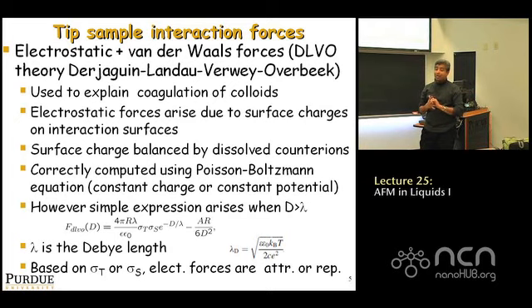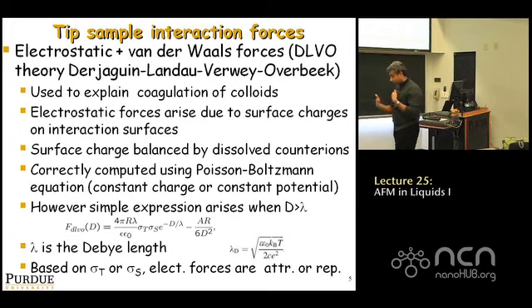When you dissolve salt in water and have ions, the shielding becomes very strong. Now you have free positive and negative ions, so it's not just the dipole moment of the water molecule you're using to shield; you're actually using fully positively or negatively charged ions to shield your charges. So the key thing that happens in water, number one, is that the electrostatic forces get shielded. You feel them only a certain distance away, and the extent of shielding depends on the polarity of the liquid, the salt concentration in the liquid, and so on.